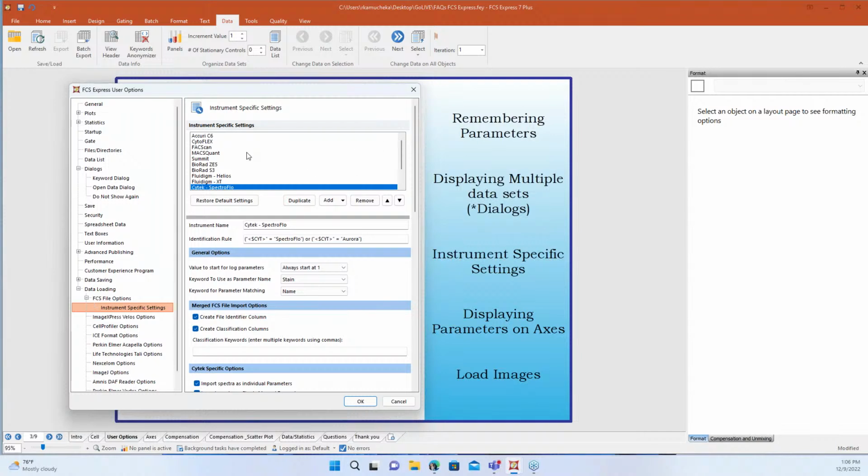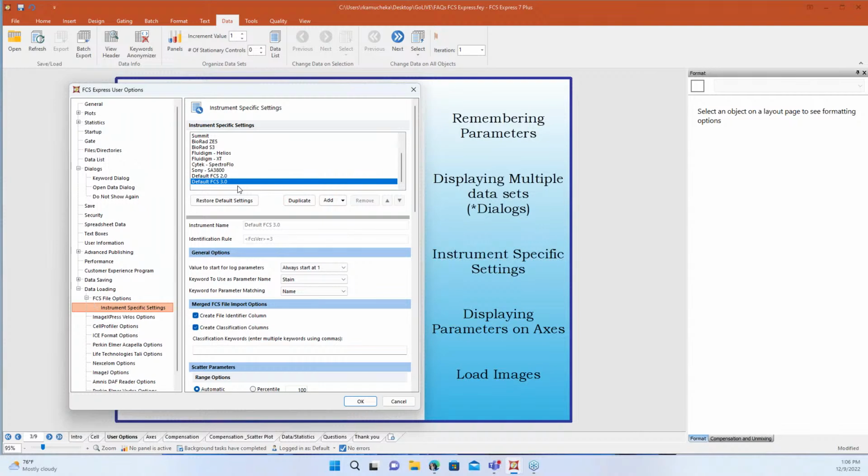And with these instrument specific settings, you can add different instruments. So you can also control how your data is being displayed. It's telling FCS Express what you want to see and how you want those parameters to be scaled, but you can also do a really broad version. If we just want to do a default FCS file, we can, if there are no instrument settings above it, because that is the priority. If there are any instrument specific settings, it will use those first.